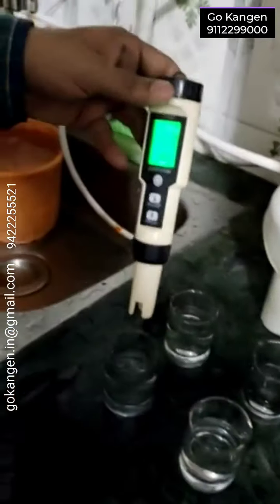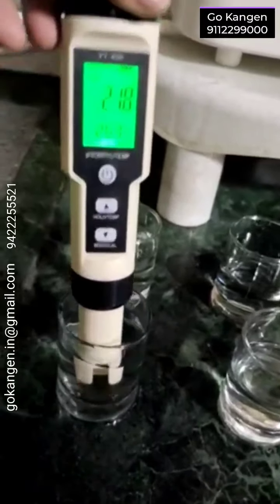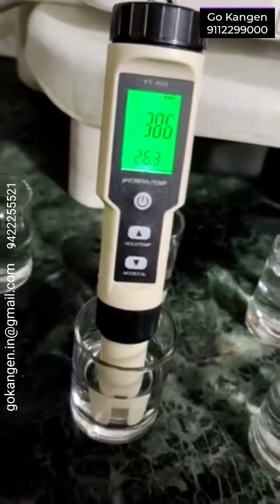So I will just show you. This is tap water. For tap water, ORP is positive — you can see that. This one is 2.5 pH. Again, positive, it is rising.